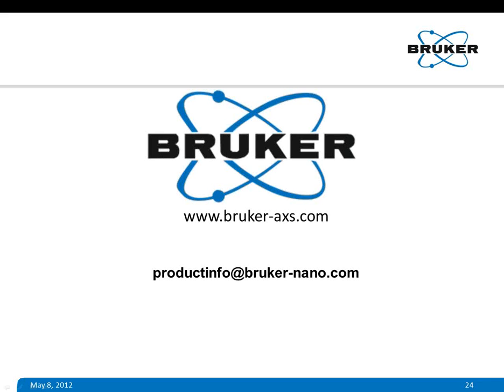We have a question here. Early in your presentation, you mentioned that the tribometer can measure wear volumes. How is that measured, and can you differentiate between mechanical and tribocorrosion dictated wear volumes? So maybe we'll take it as two questions. One is, you mentioned that the tribometer can measure wear volume. So how is that measured?